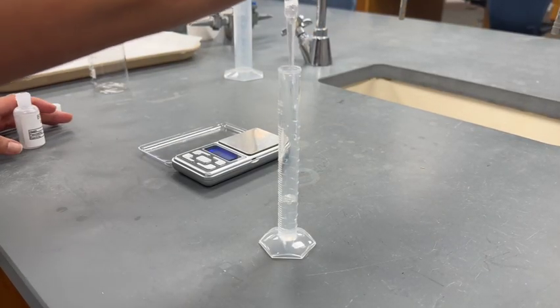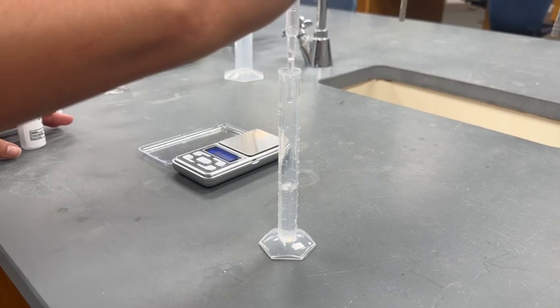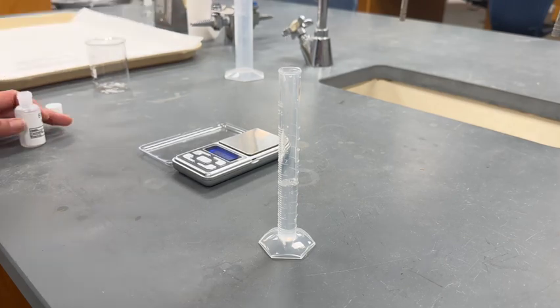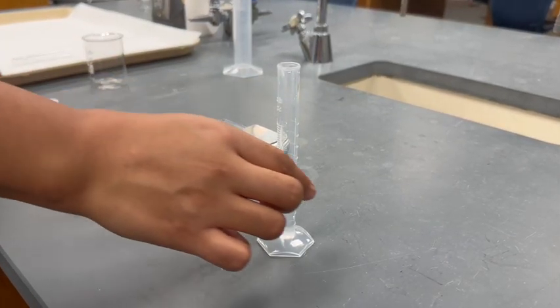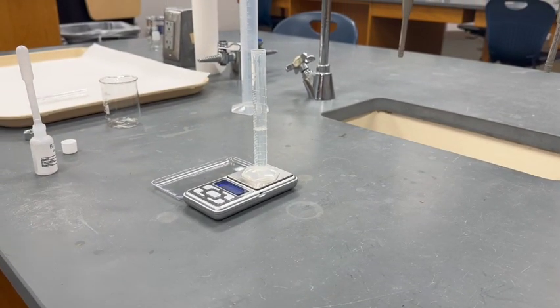For the second trial, add about 2 more milliliters of unknown A on top of the unknown A from trial 1. Record the volume — it should be around 5 milliliters. Place the graduated cylinder back on the balance to record the mass. Subtract the mass of the empty graduated cylinder from trial 2 from the mass of the graduated cylinder and unknown A. Use the mass and volume of unknown A, trial 2, to calculate density.